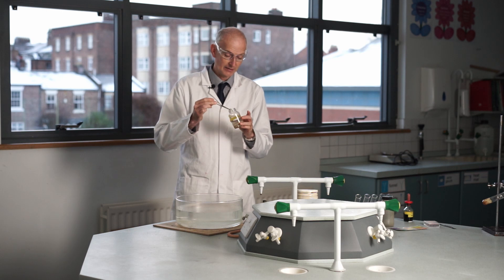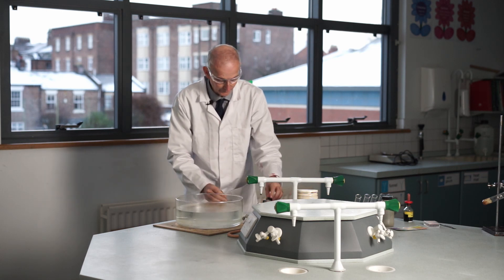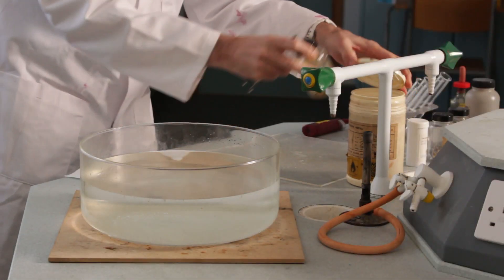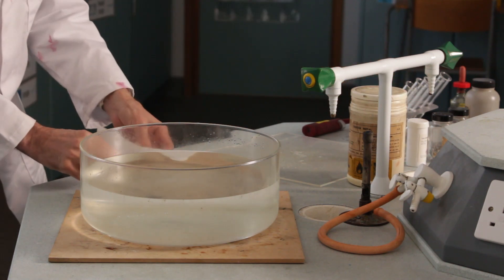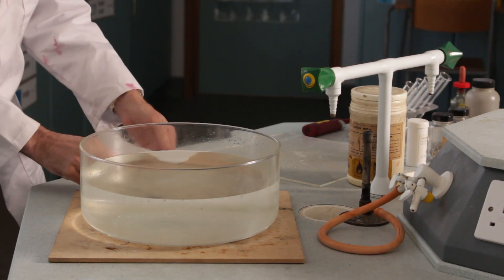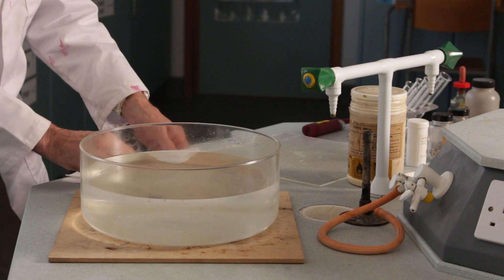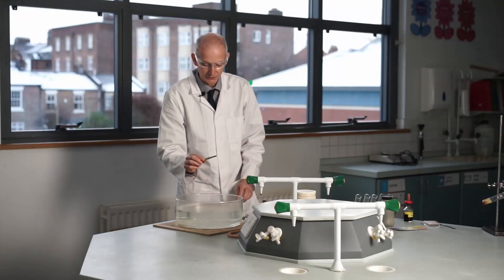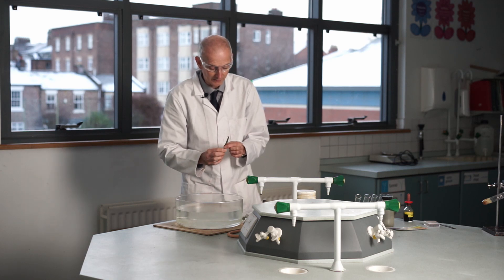We need to dry it off to get rid of the oil, because if we try to add it to the water while oily, the water won't get to it. So pop that back in and dry this off. Then we're going to pop it into this trough of water. It's a nice shiny grey metal.